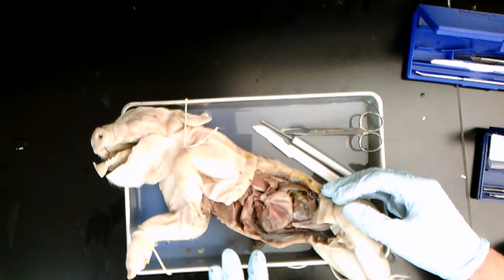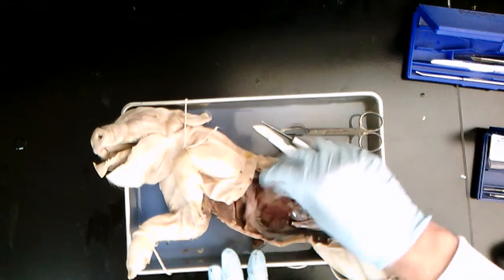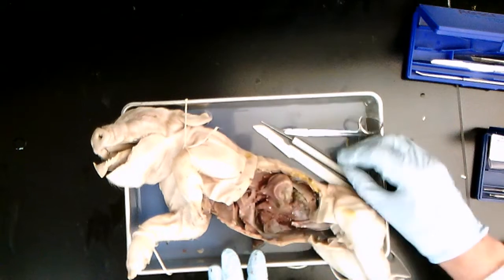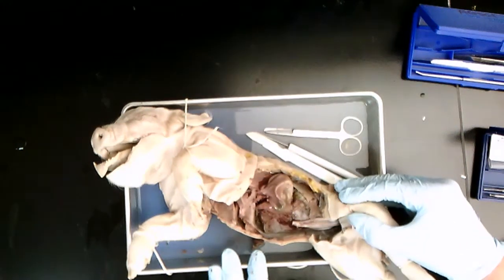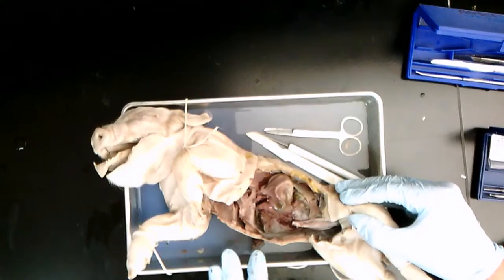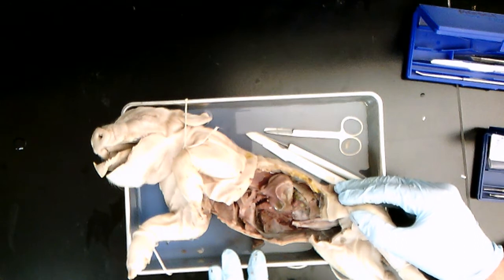Also, it's an opportunity to talk about meat evaluation, and if you taught meats before this, it'd be a review. If you haven't, just talk about where some of the cuts would come from on the animal too. So lots of extensions, definitely, and you will not have an issue keeping students' attention when you're dissecting pigs.